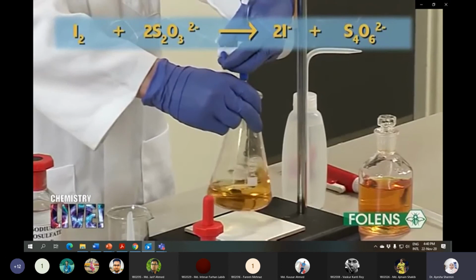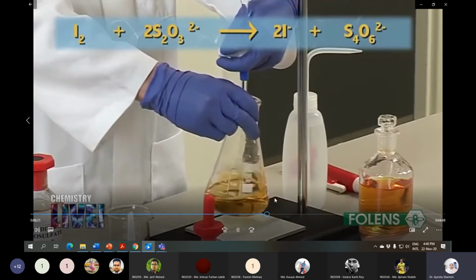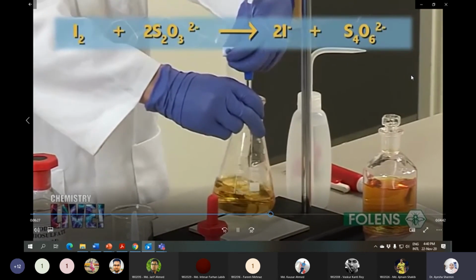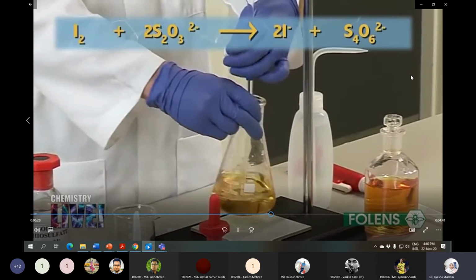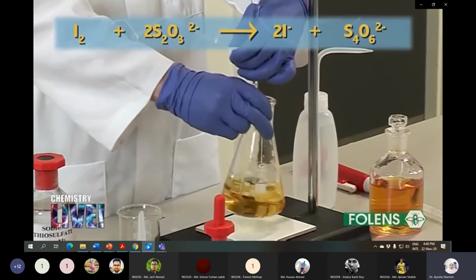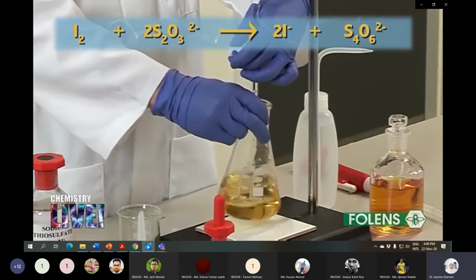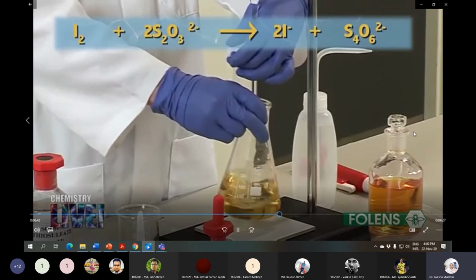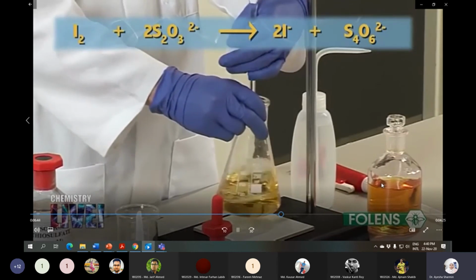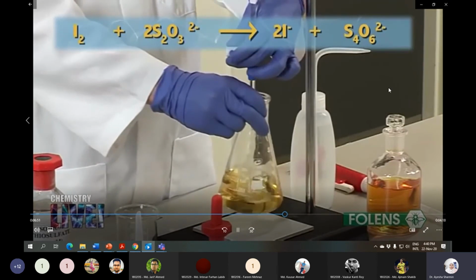So you can see they also kept a bottle here so that you can see the color change from this brown to this light yellow color. Note one more thing, they are always keeping this stopper closed on the bottle because you have to repeat this experiment multiple times so that you can get an average DO amount from your sample.